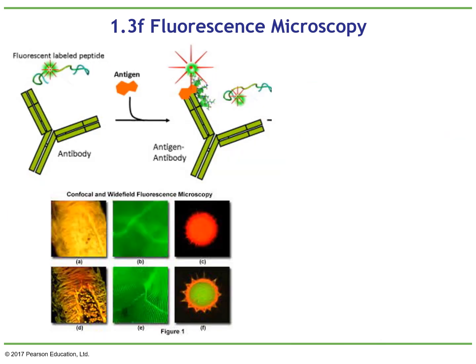So now let's think about how we do an antibody staining. You can have antibody staining with fluorescent molecules. So we need three things. One thing, an antibody. Another thing, a fluorescent molecule. And another thing that you have is an antigen. So, three things. The antigen can be a protein that is located in the cell. It can be located, for example, here, outlining the membrane. You remember cell membranes have proteins, and that protein is located there.